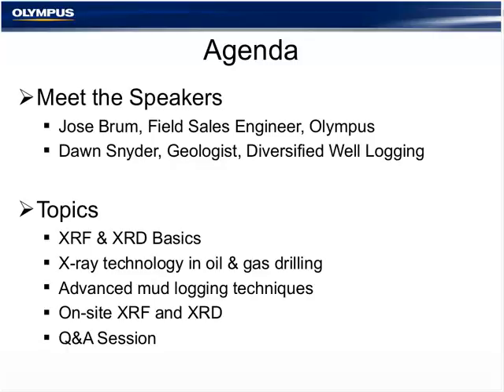Today we'll review XRF and XRD basics, X-ray technology in oil and gas drilling, advanced mud logging techniques, how XRF and XRD are used on-site, and finish up with questions from the audience. This informational webinar is scheduled for about an hour.